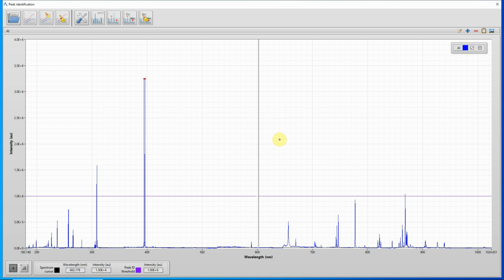If the user clicks on the Find Peaks shortcut button again, Libsoft will clear any peaks in the displayed wavelength range that are already marked, warning the user first, and then repeat the peak finding process using the revised threshold value. So we now have these peaks marked as well.